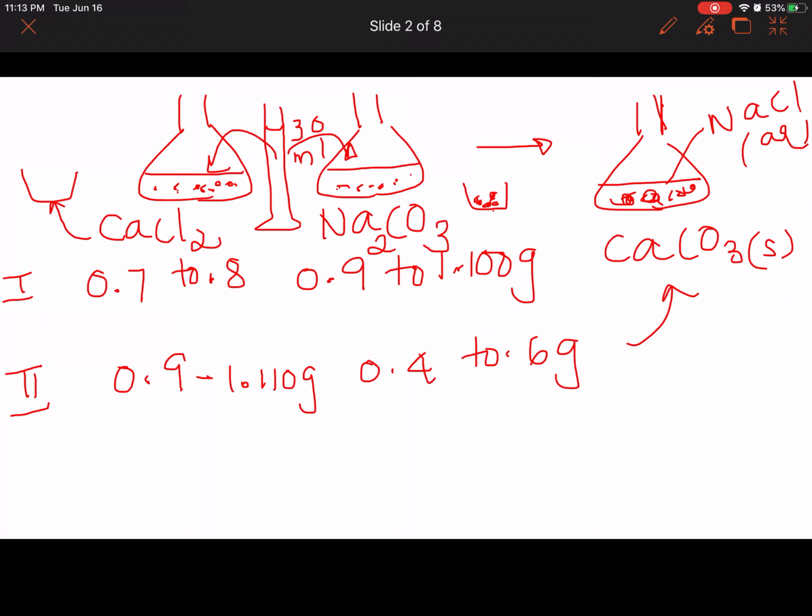Now, like I said earlier, after you make the calcium carbonate precipitate, you're going to do a vacuum filtration. And how do you do a vacuum filtration? Again, you will watch it in the virtual video. You're going to be using a Buchner funnel. A Buchner funnel is a porcelain funnel, and then we have filter paper. It has some holes for it to filter, and then you're going to put a filter paper.